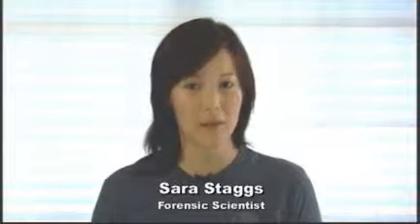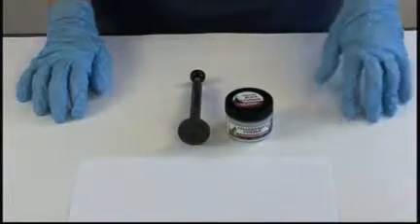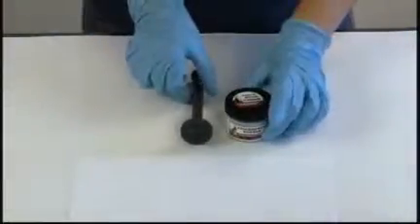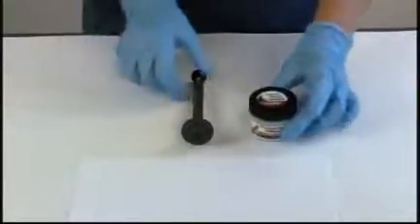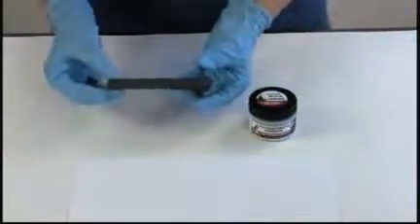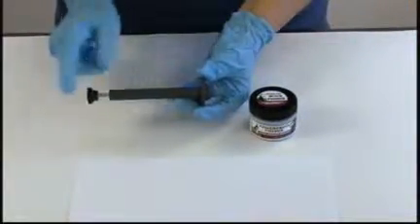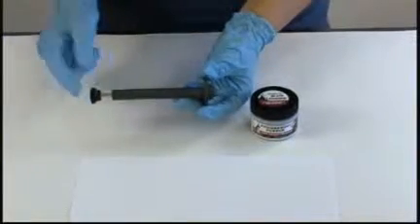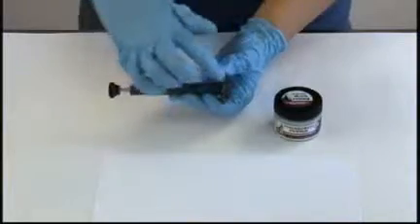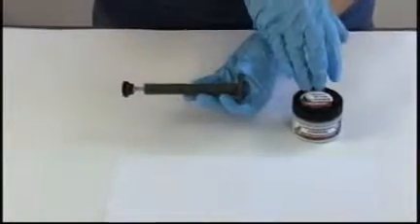For this video, we're going to be developing latent prints with magnetic powder. The tools that we'll be using for our magnetic powder development of latent prints are our magnetic powder and the magnetic powder wand. So the way that this wand works is that there is a magnet at the end of this plunger, and when this plunger is fully depressed like it is now, the magnet's at the base, and therefore we can pick up the magnetic powder.